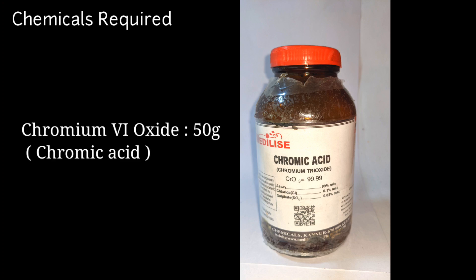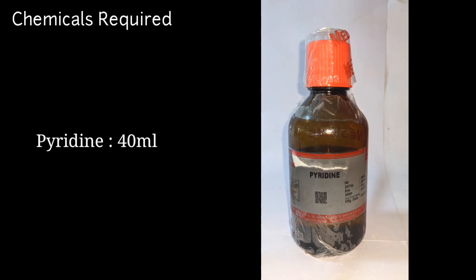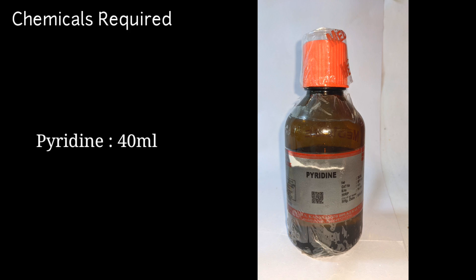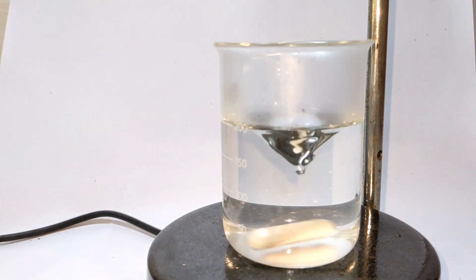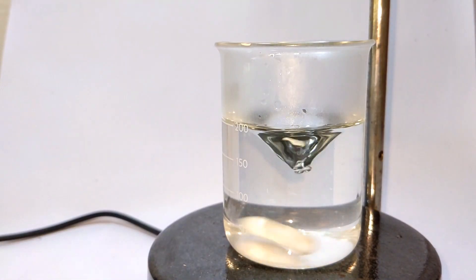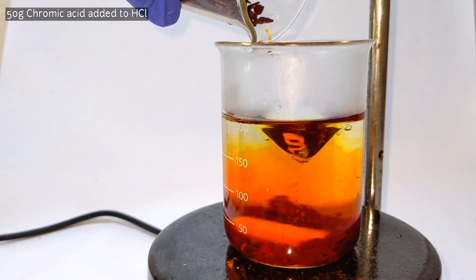The chemicals you will need for this preparation are 184 milliliters of 6 molar hydrochloric acid, 50 grams of chromium trioxide (chromic acid), and 40 milliliters of pyridine. This reaction involves the preparation of chlorochromic acid and then adding pyridine to it.